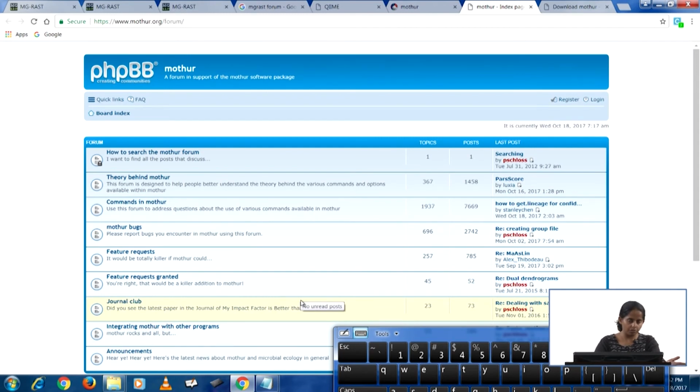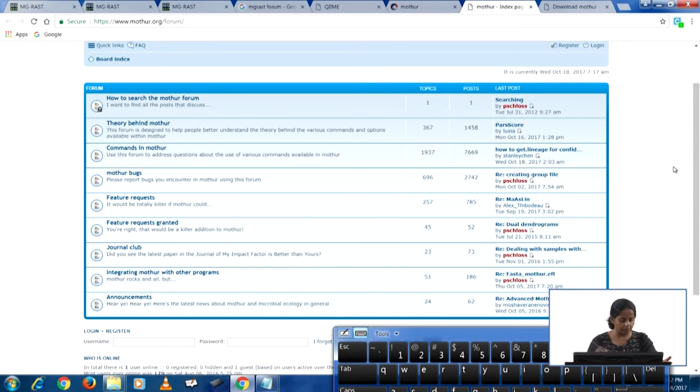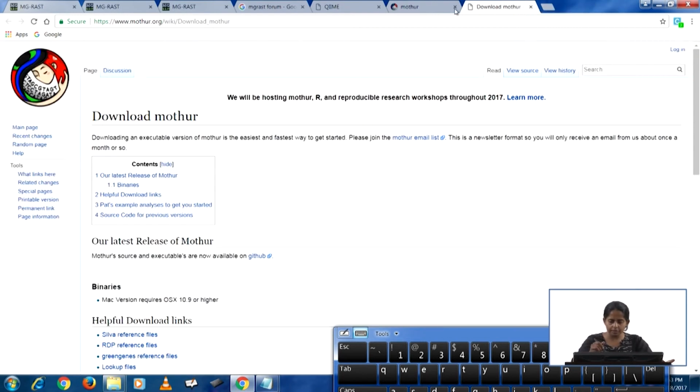And if you have questions, when you're trying to follow a particular SOP from the wiki of Mothur, there is this wonderful forum here, which supports the Mothur software package. You can ask a lot of questions, and if there's a feature you want to see, you can request it in here. This is a very supportive community, and very quickly someone will respond and help you with your analyses. Alrighty students, this is Mothur for you.